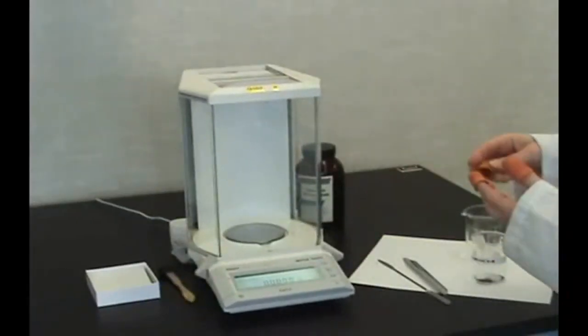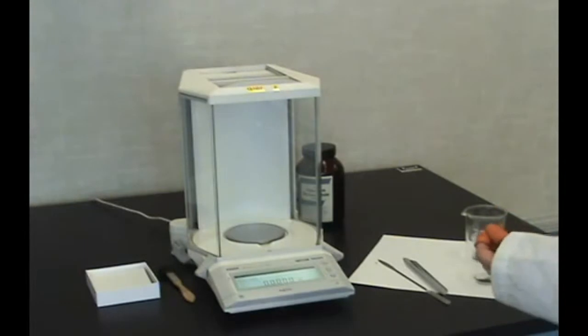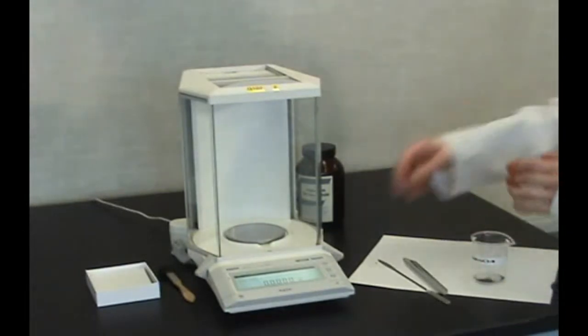To minimize waste, do not weigh excessive amounts. Use finger cots to handle your weighing vessel so no oil is transferred to add weight.